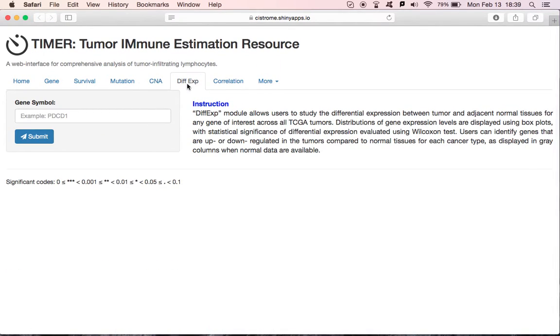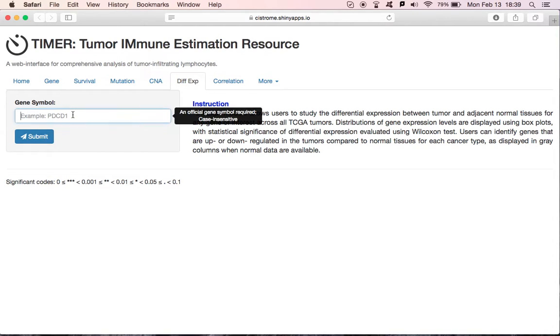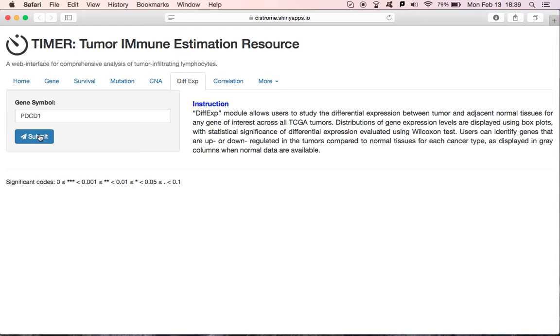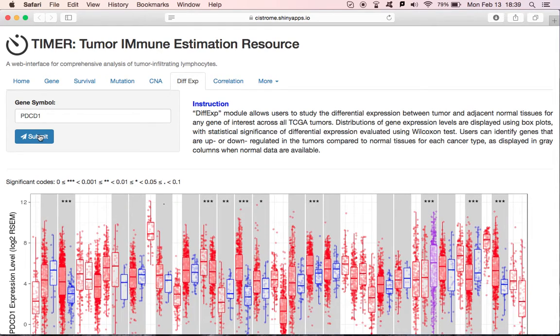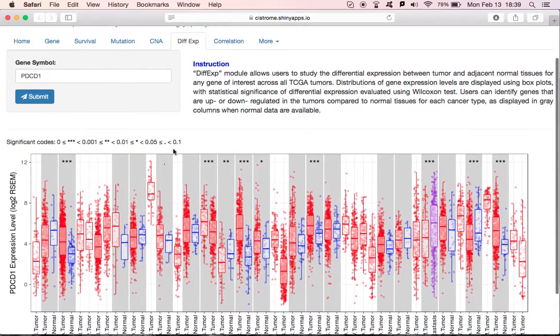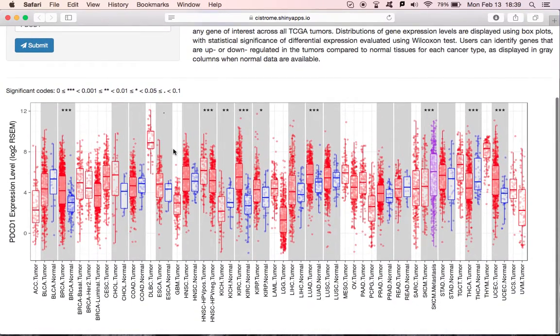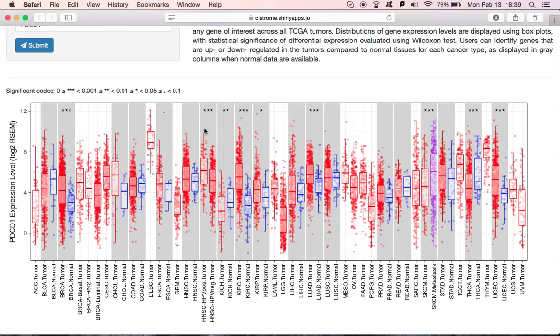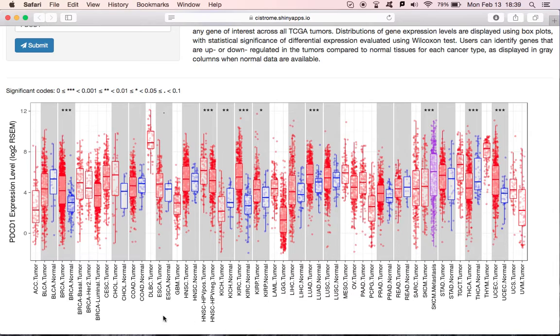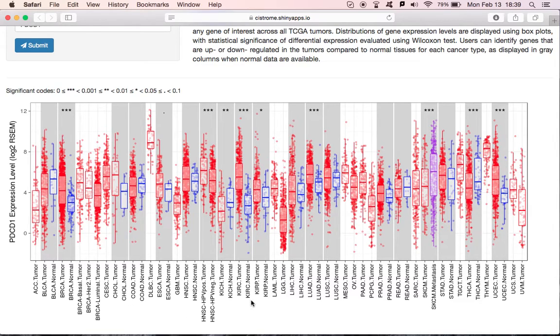The fifth module is differential expression module. It could explore the gene expression across all cancer types. Simply input PDCD1, and click Submit. Users can identify genes that are up or down regulated in the tumors compared to normal tissues for each cancer type as displayed in gray columns where normal data are available. Here, we can see most cancer types have a higher PDCD1 expression, like breast cancer, kidney renal cell carcinoma, and lung adenocarcinoma.